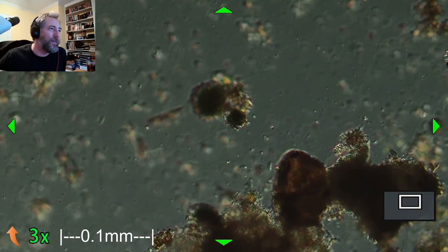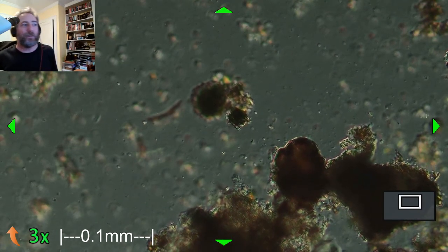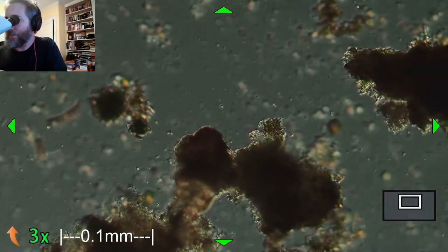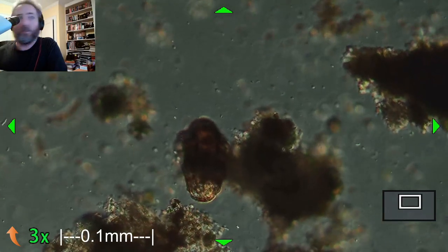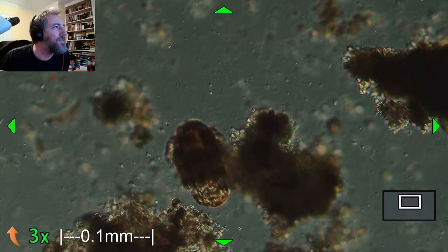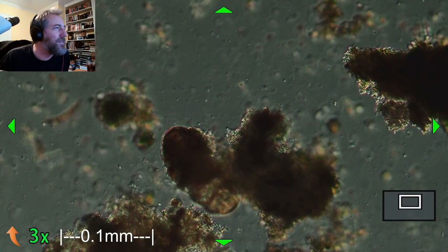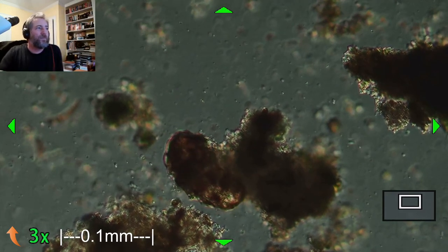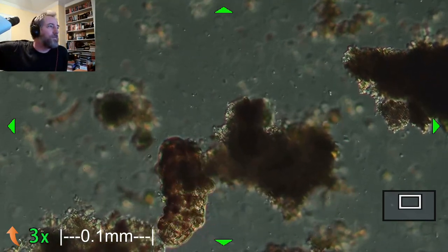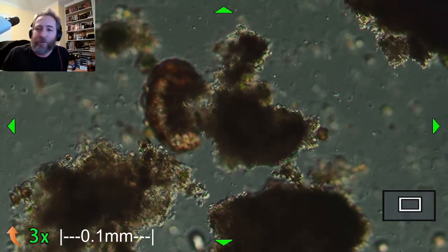I kind of wish it would transfer over to that bigger particle, bigger piece of lichen, so it would stop spinning around quite so much. See some little ciliates crawling around in here as well. Because we're zoomed in, I can just sort of bump the field of view a little with my camera.